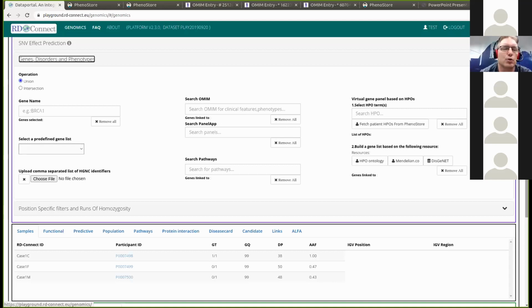So you need to be able to tweak these parameters but get the results back quickly, which is not something you would be able to do if you were still doing this in the old-fashioned way, which was basically getting a short list of results, a manageable list of results in an Excel table, and then trying to filter by all the different possibilities within your Excel table.